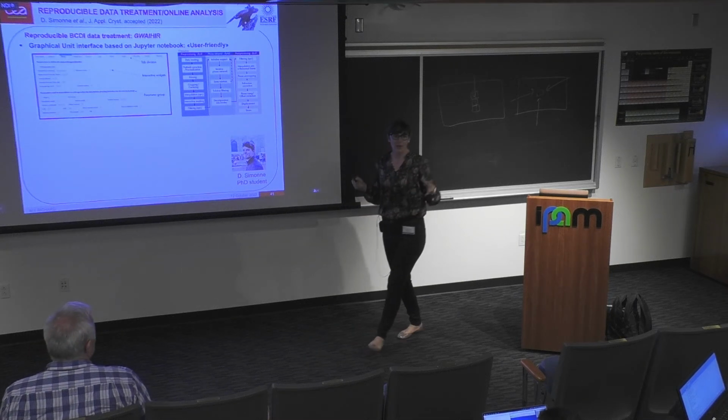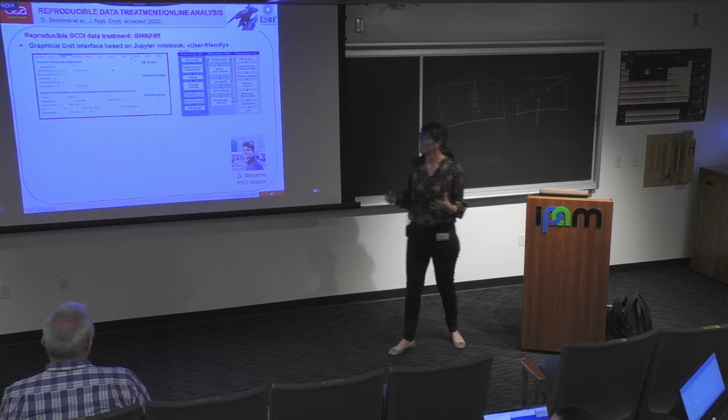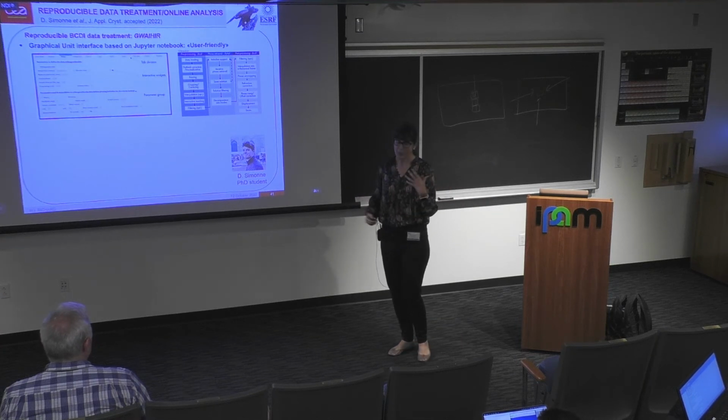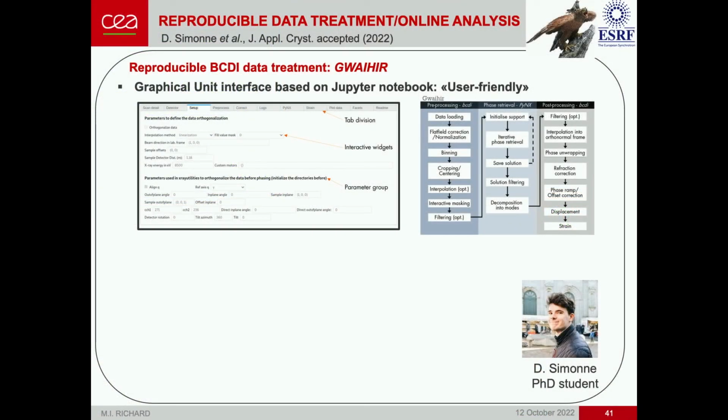Then, when we are doing in situ operando Bragg coherent diffraction imaging, we want to do the data treatment very fast, online. For this, David, with a PhD student in the group, has developed a graphical user interface based on the Jupyter notebook.